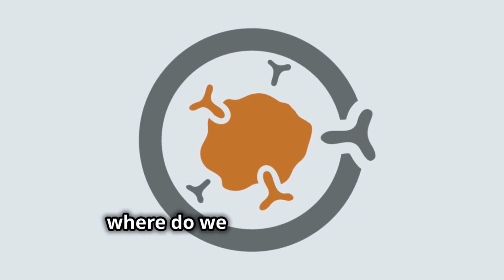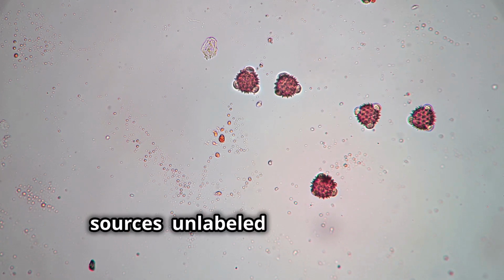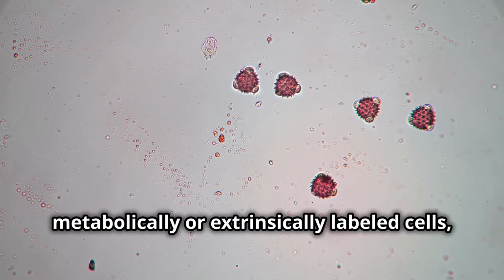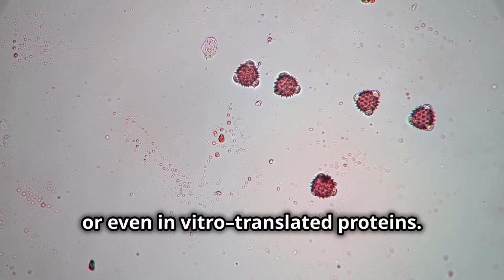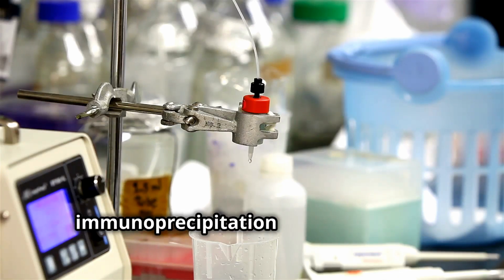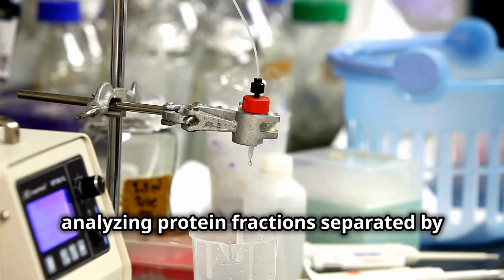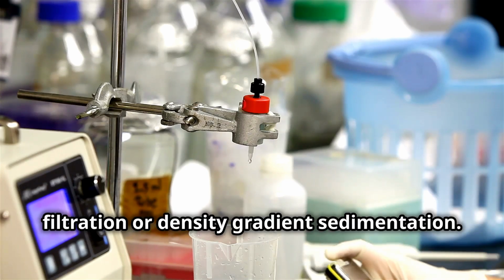First off, where do we get our antigens? They can come from a variety of sources: unlabeled cells or tissues, metabolically or extrinsically labeled cells, subcellular fractions, or even in vitro translated proteins. And it's not just about isolation. Immunoprecipitation is also great for analyzing protein fractions, separated by other biochemical techniques like gel filtration or density gradient sedimentation.